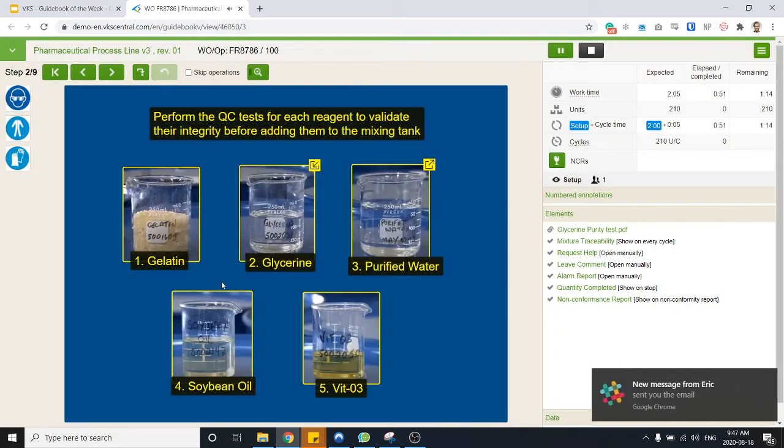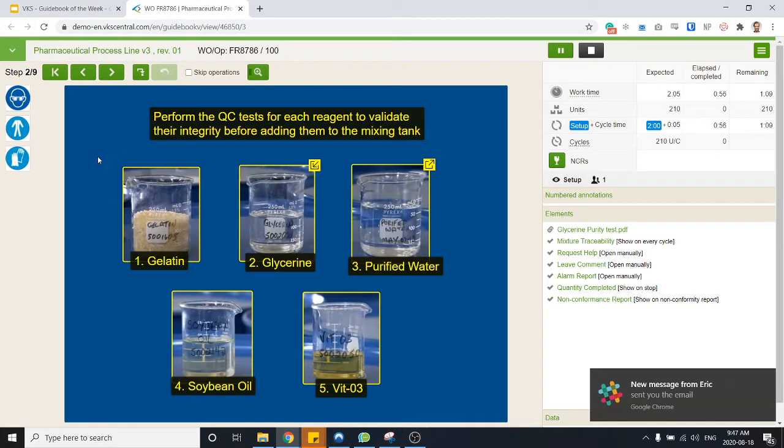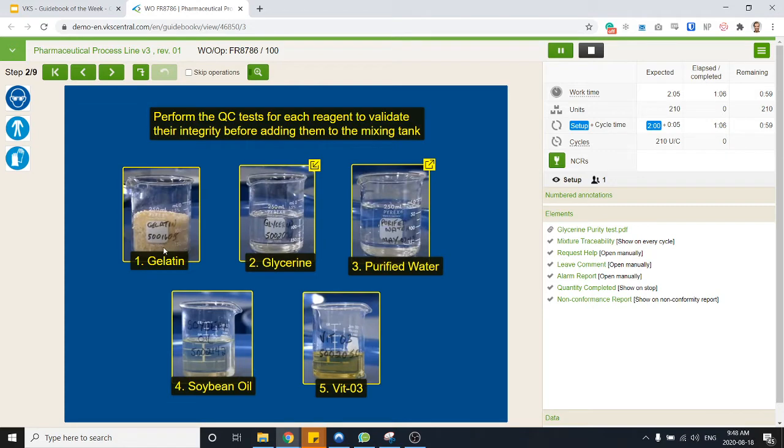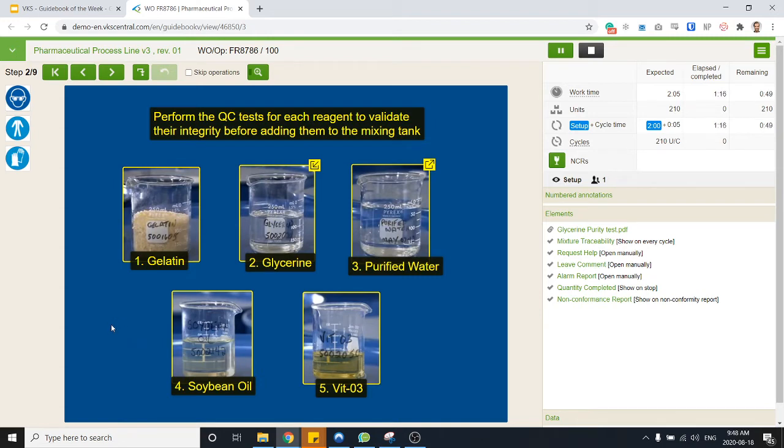So let's hit save on that. Here you can see that my first step consists of multiple pictures. It can always be a collage of different things, it doesn't have to be one step. In this case it's asking me to make sure I have performed the quality checks for each one of those reagents that I'm going to mix together in my tank.